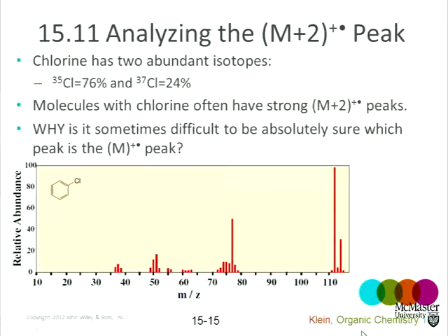Okay? The bond stretching frequency in the infrared, that's way down in the fingerprint region, not reliable. So mass spectrometry, of course, will tell me immediately whether I have an alkyl chloride or a bromide, because chlorine and bromine have totally different molecular weights. But actually, it turns out that we have another way to tell whether a molecule contains chlorine or bromine, or how many halogens it contains.